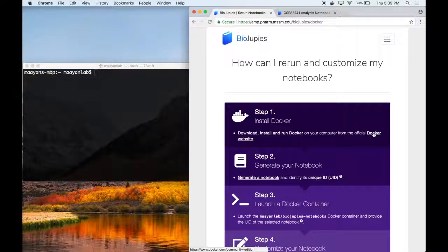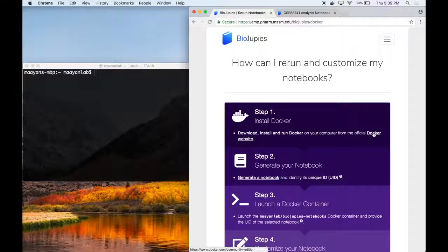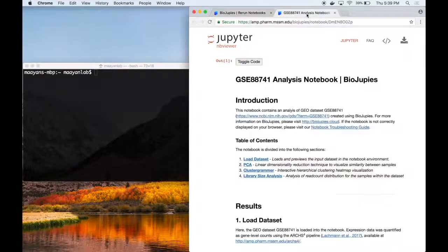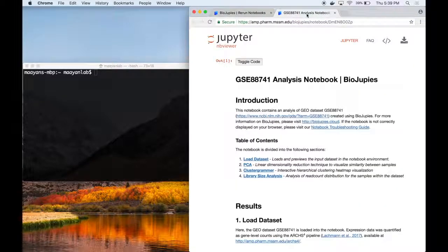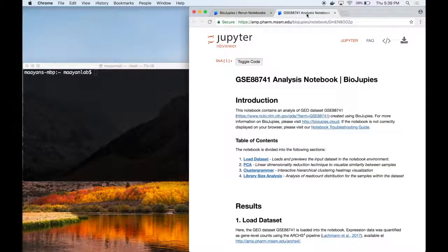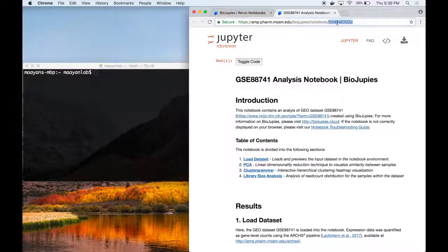Second, the user must generate a notebook from BioJupees and identify its unique ID, which is a 9-character long alphanumeric string displayed on the right of its URL.